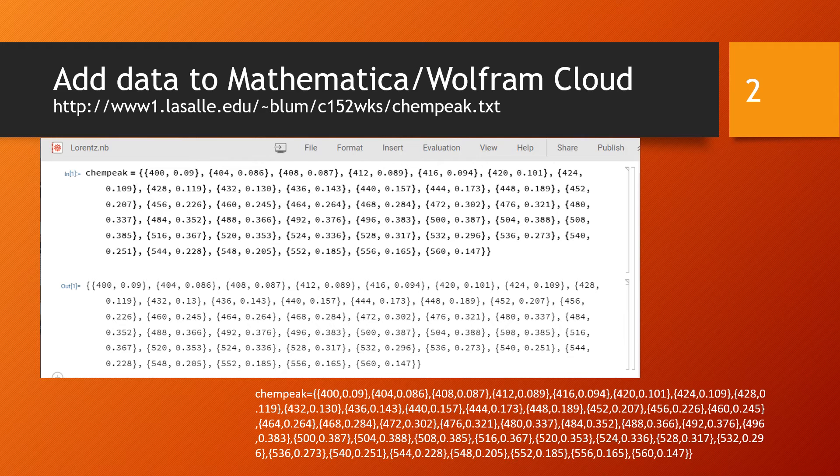We enter the data into Mathematica. We have named the data ChemPeak and the data is a set of sets, so there's curly brackets around the set and then each data point is an x and a y point, which marks the frequency (x) and the absorption (y).